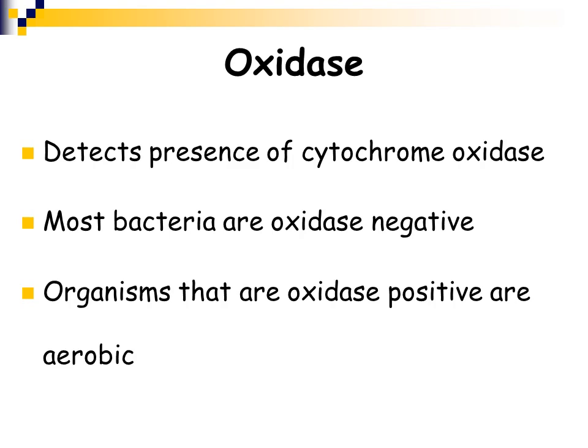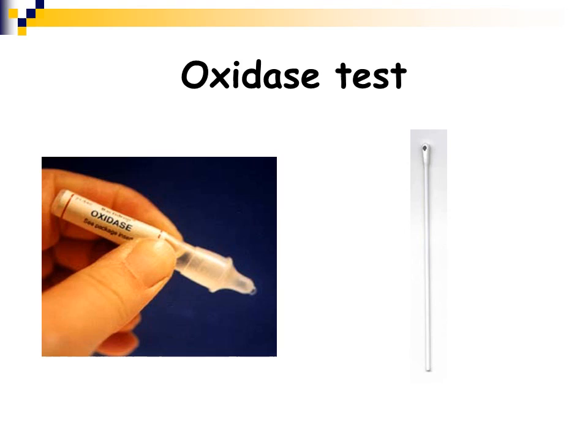So if you had a clinical specimen in the microbiology lab and you knew it was a gram-negative organism and you wanted to see if it was an Enterobacteriaceae member or not, you can quickly do an oxidase test. It's a test that takes about 2 seconds to do, and that's why it's still done in the clinical laboratory, to get an idea of what you might be looking for.